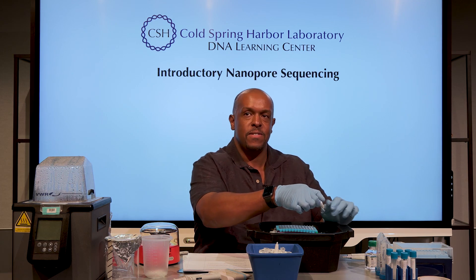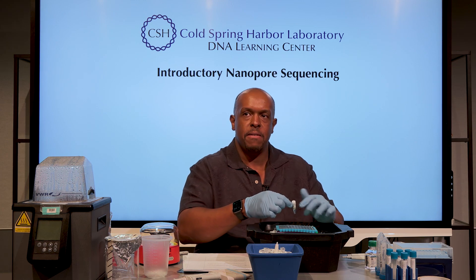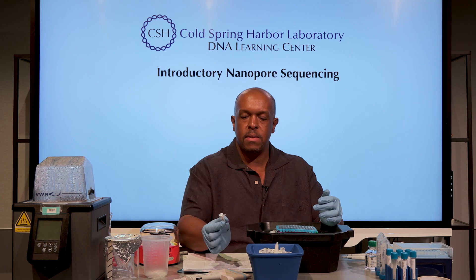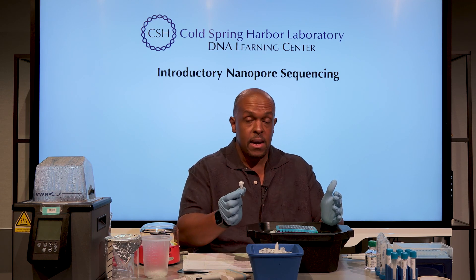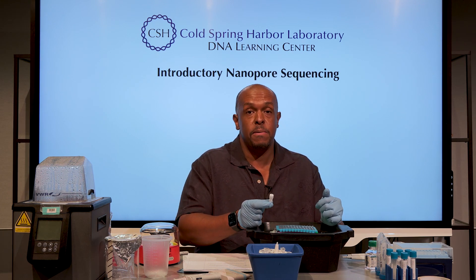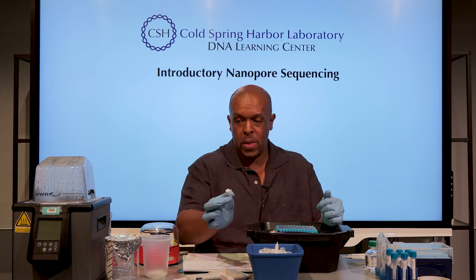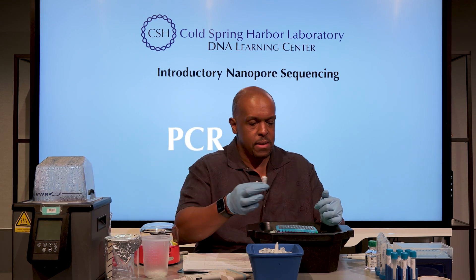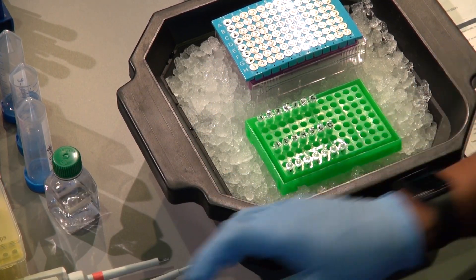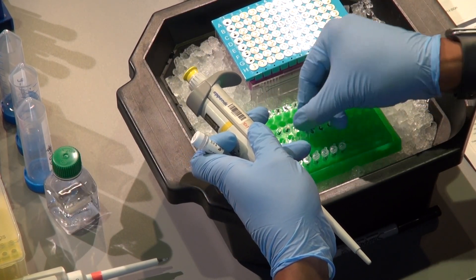To avoid contamination, before I open up tubes of DNA, I'll aliquot from my stock tube of 2x master mix — this NEB Long Amp — first. I'll mention that this NEB Long Amp TAQ is one of the things that does not come with the kit, so please check the kit. They're very good at telling you what third-party reagents you need to buy ahead of time, and this is essentially the only one besides water and ethanol. We need 25 microliters of that, so I'll aliquot it into these tubes and then do the DNA transfer.